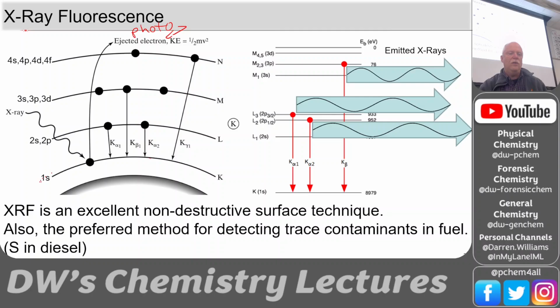Now there's a hole in the 1s orbital. And so those other electrons are not going to sit in the 2s orbital or the 2p orbital when there's a place really close to a very positive nucleus. And so they're going to jump down into that seat. Okay? It's like the prime location. This is front and center, front of the television. So they're going to jump down and they're going to kick out emitted X-rays. So this is X-ray fluorescence. This is the fluorescence signal.